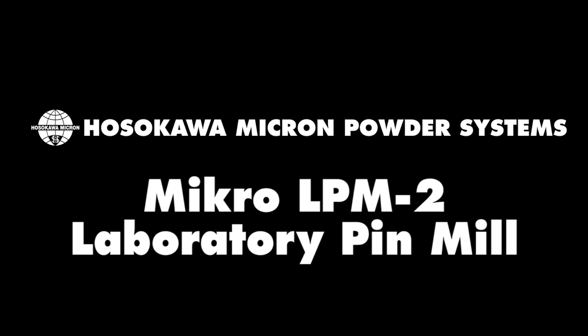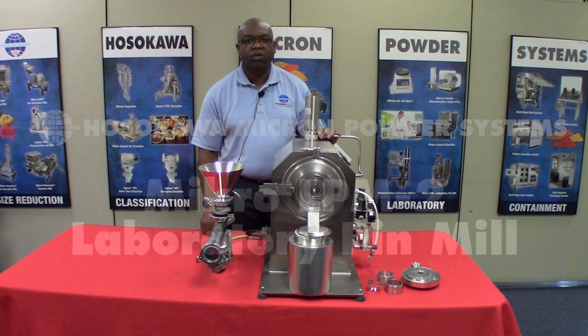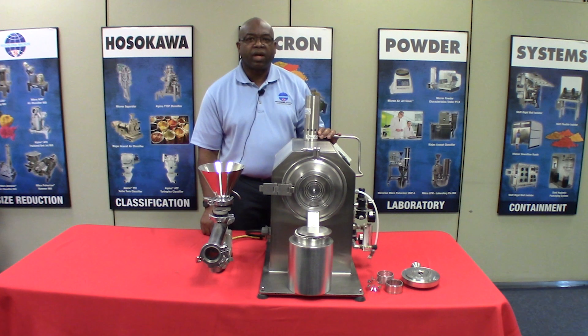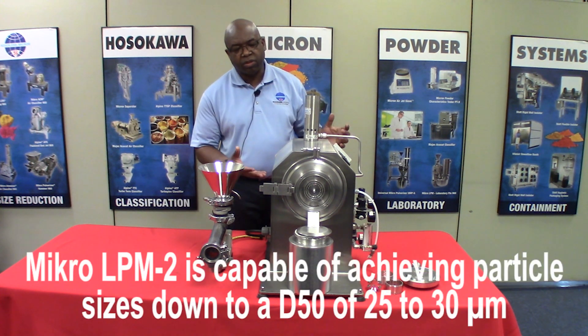My name is Lloyd Sutherland. I'm an applications engineer here at Hosekao Micron Powder Systems, Summit, New Jersey, and today I'd like to introduce to you our LPM2 tabletop laboratory mill.